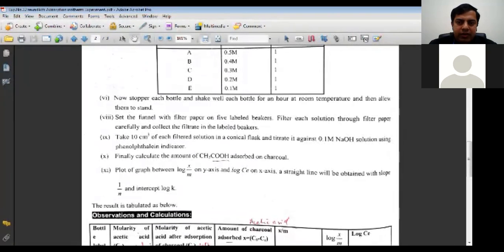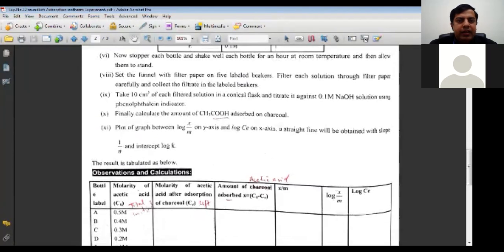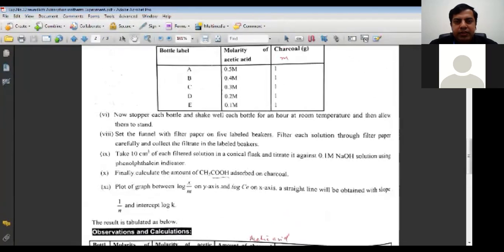One will be the solid, which is the activated carbon, and it will remain below, and the outer layer will be the acetic acid. For the settling, you can filter the acetic acid out of the activated carbon. And then again there is an acid-base titration.